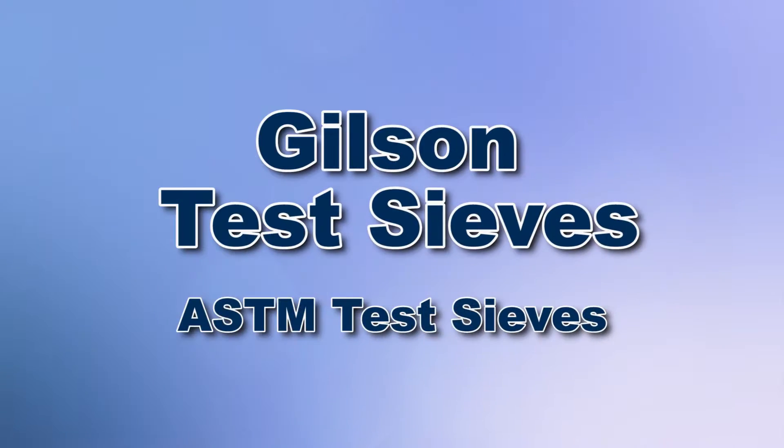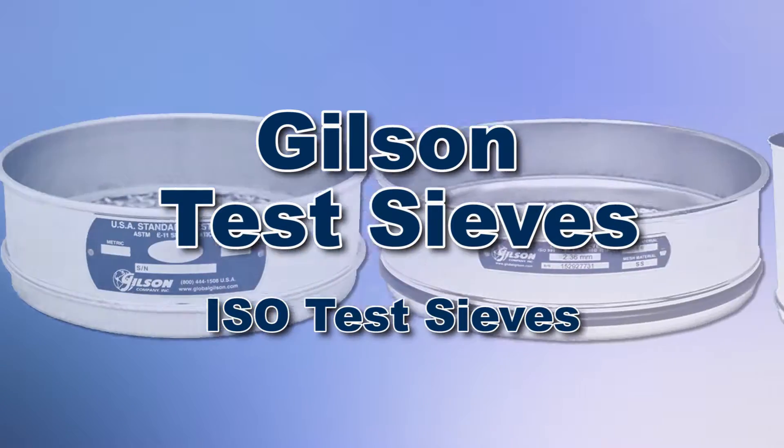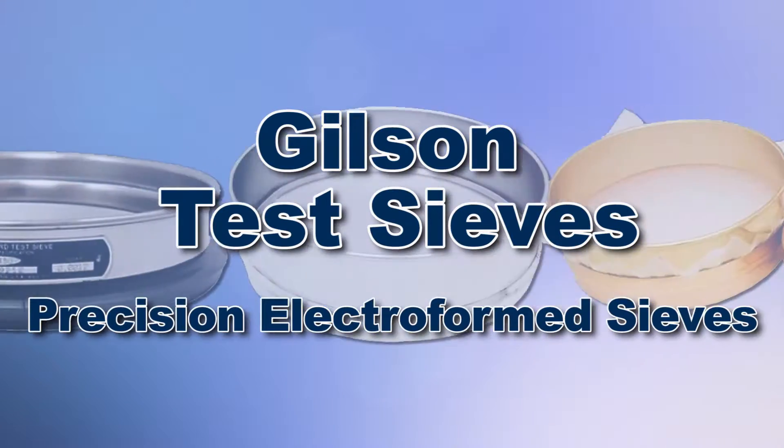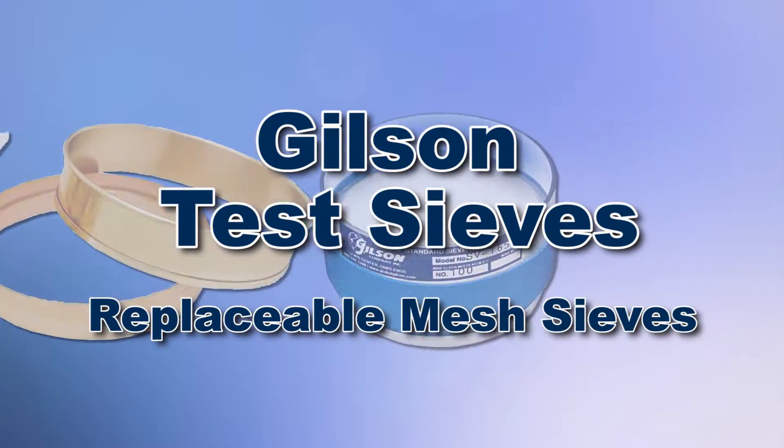With Gilson's complete family of test sieves offering a wide range of performance features and capacities, Gilson has the right equipment for your fast, accurate and reliable sieve analysis.